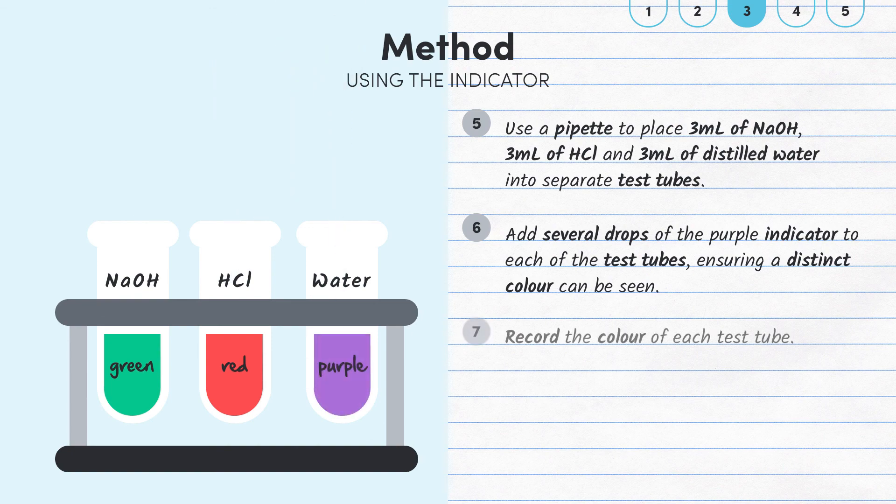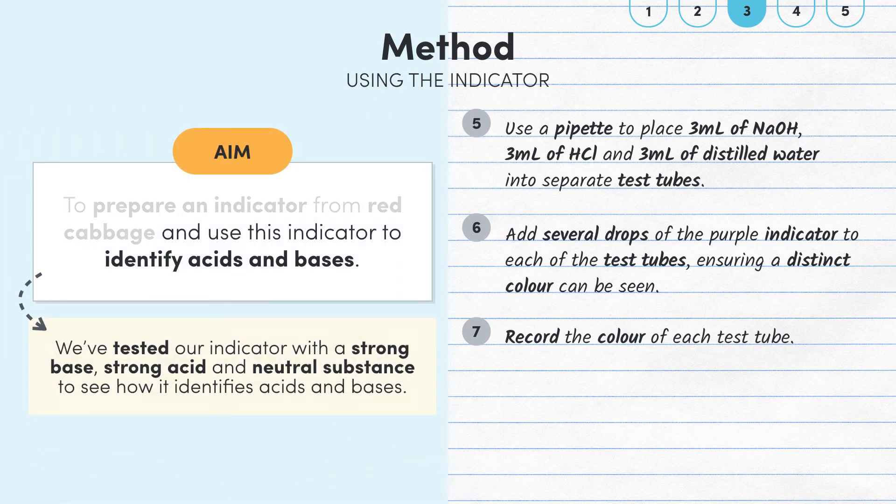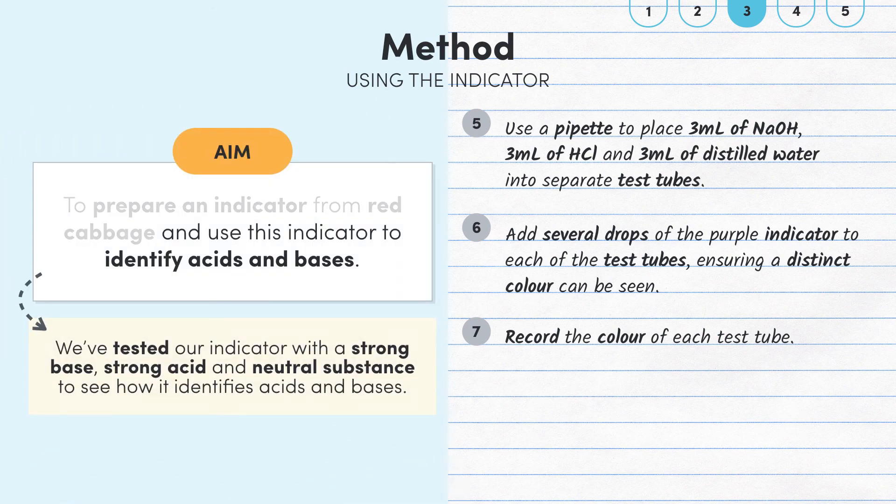Finally, record the colour of each test tube. In these final 3 steps, we're testing how our natural indicator works with a strong base, strong acid and neutral substance to see how our indicator identifies acids and bases.